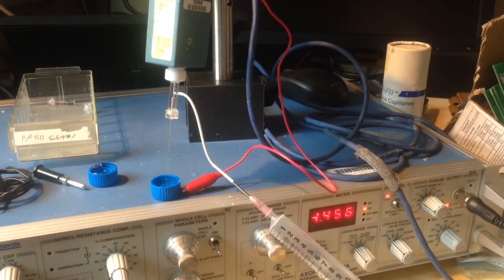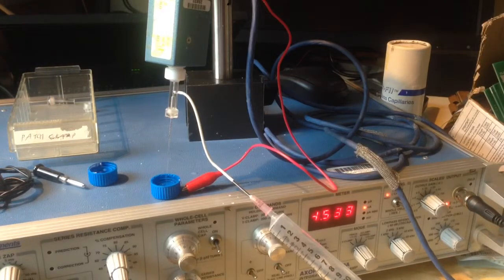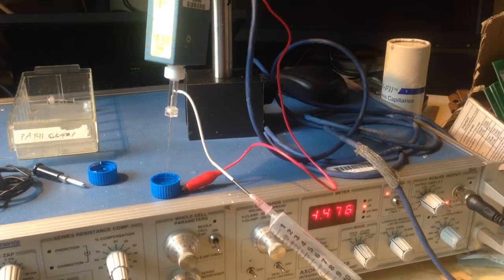Today I decided to see if I could get any kind of current going through the pipettes that I pulled yesterday. I'm not really trying to do anything sensible. Just have a go and see if I can get anything working. And I think I fulfilled my goal of seeing that I could get a current that varies with the voltage. It's not a particularly ambitious goal, I don't think, but that's the idea.